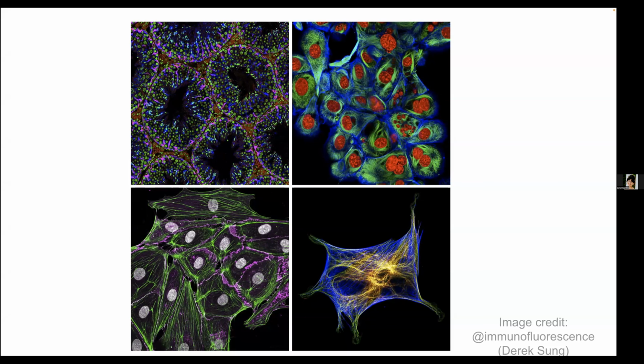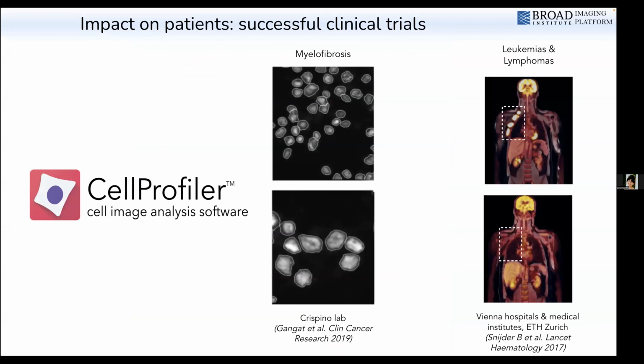It's a tool that's widely used as a workhorse for analyzing images, but I won't be talking at all about image analysis today, per se, or CellProfiler, except to mention that the most deeply satisfying outcome for its creators, and I'm sure for the creators of any bioimage analysis software, has always been the role that it's played in finding new cures for diseases. And much of what I'll talk about today would be how our research, which is based on information extracted from software like these, can help drive discoveries that can impact patients.